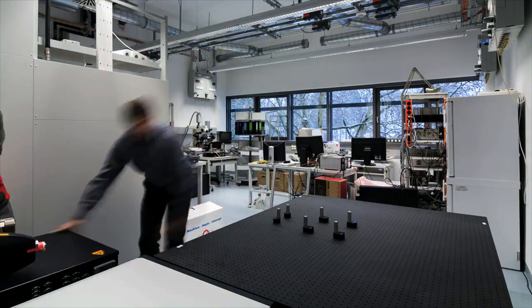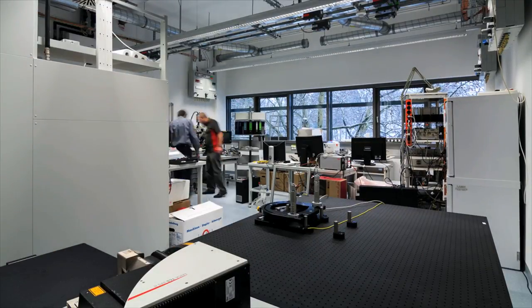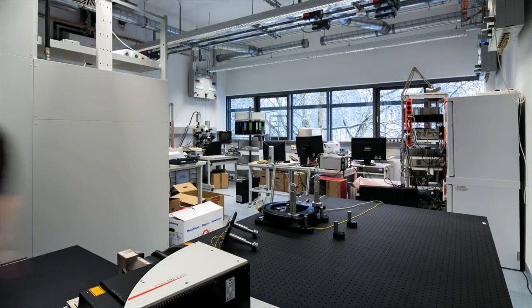All equipment is mounted on an anti-vibration table, which is very important for these precise measurements at micrometer resolution.